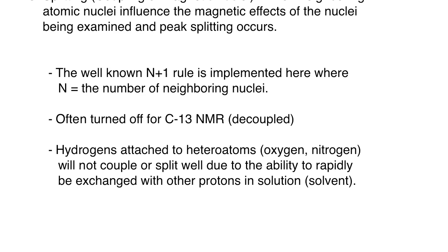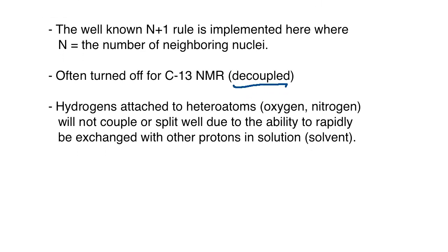This is often turned off on carbon-13 NMR, so you'll see the term decoupled, which means that when we've got the carbon-13 NMR, we are using it just to count up the unique carbons. We're not looking at any of the type of splitting that's going on there.